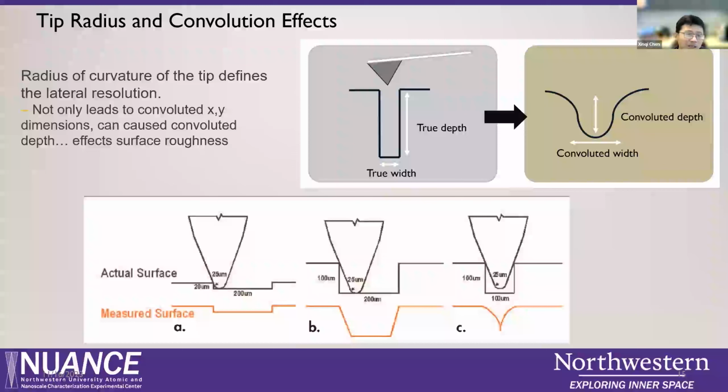On the bottom here, the different features you can see on the left are 200 wide and 20 micron deep. Like this, using our tip, you can get the measured surface, and the actual is very, very similar because that is very shallow.